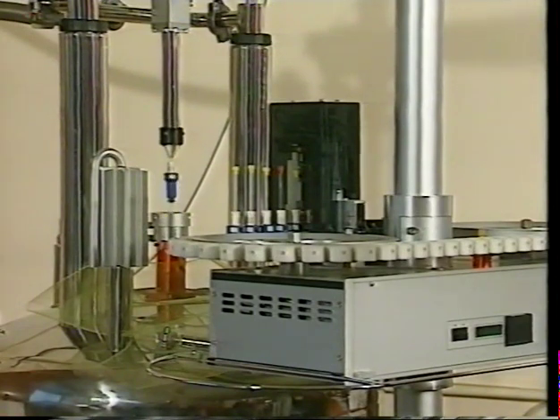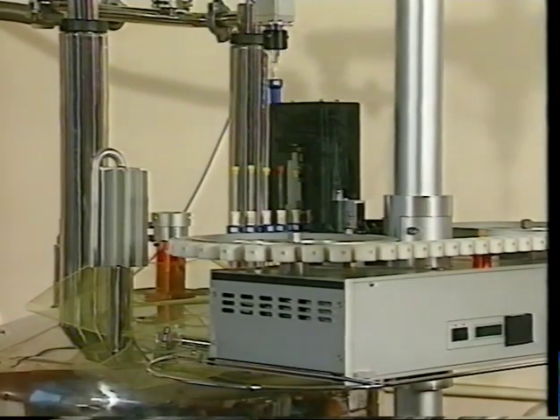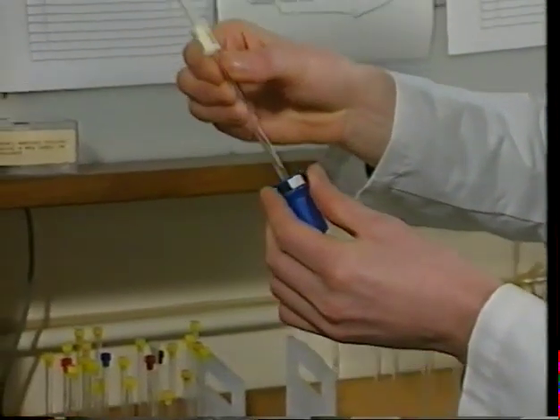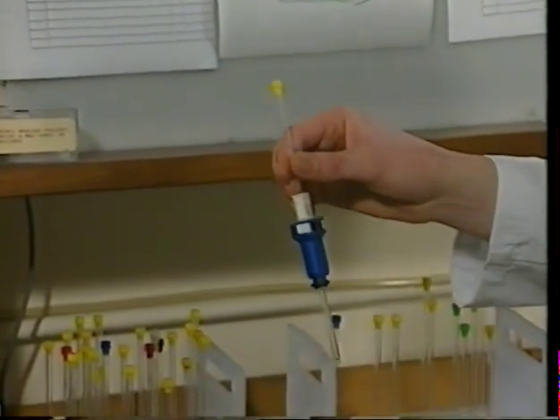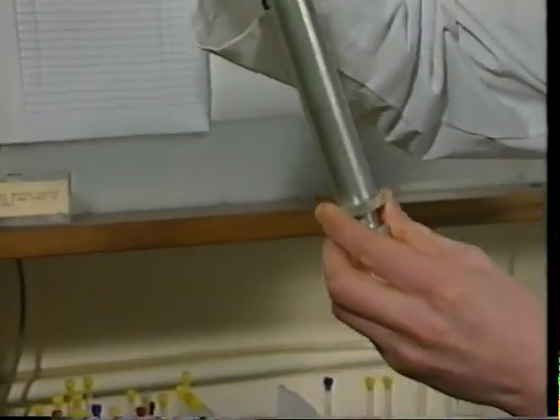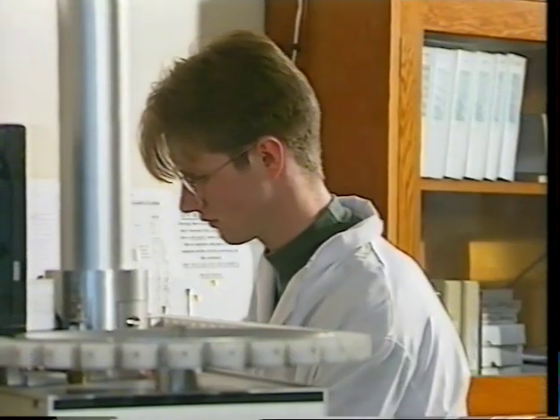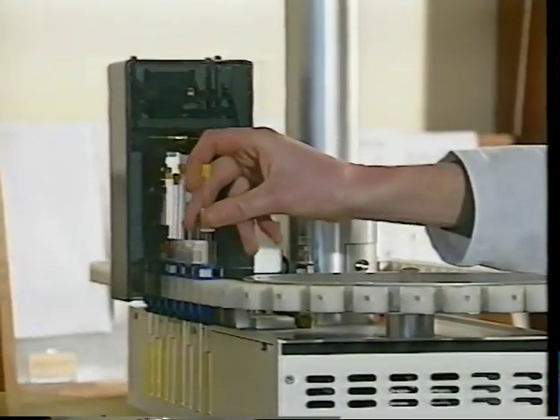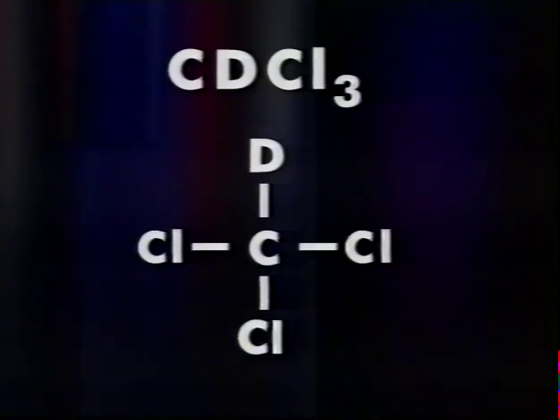So, how does NMR detect the nuclear magnetic properties, and how can we work out the structure of a compound from the information we receive from a spectrum? The sample we put in the NMR machine is usually in solution, but it's best if the solvent used doesn't give any signals of its own on the spectrum. So, for proton NMR, we need a solvent without any hydrogens in it. Deuterated solvents such as CDCl3 are commonly used.